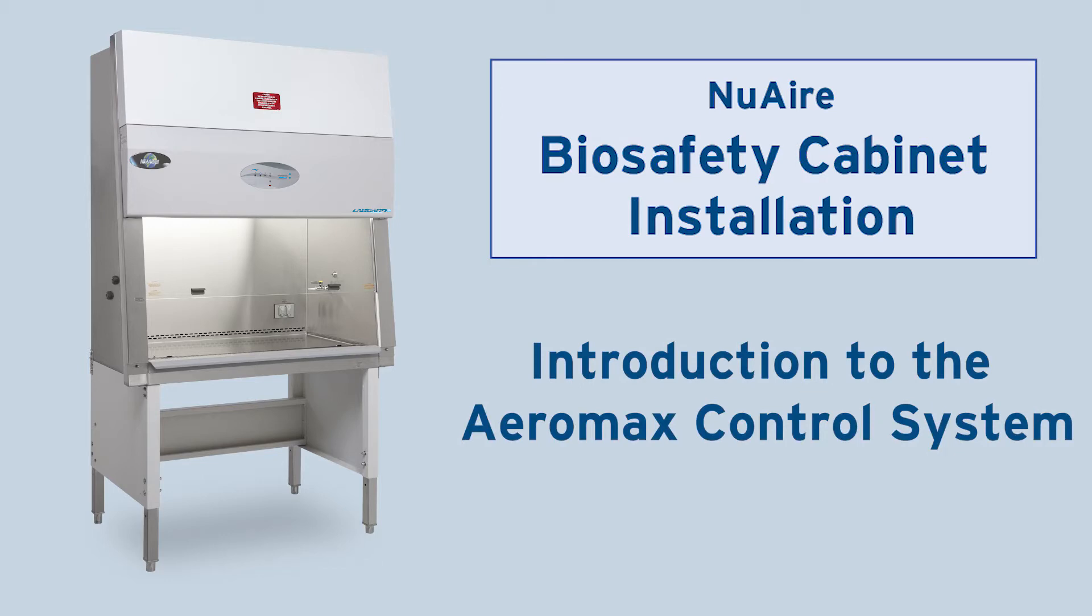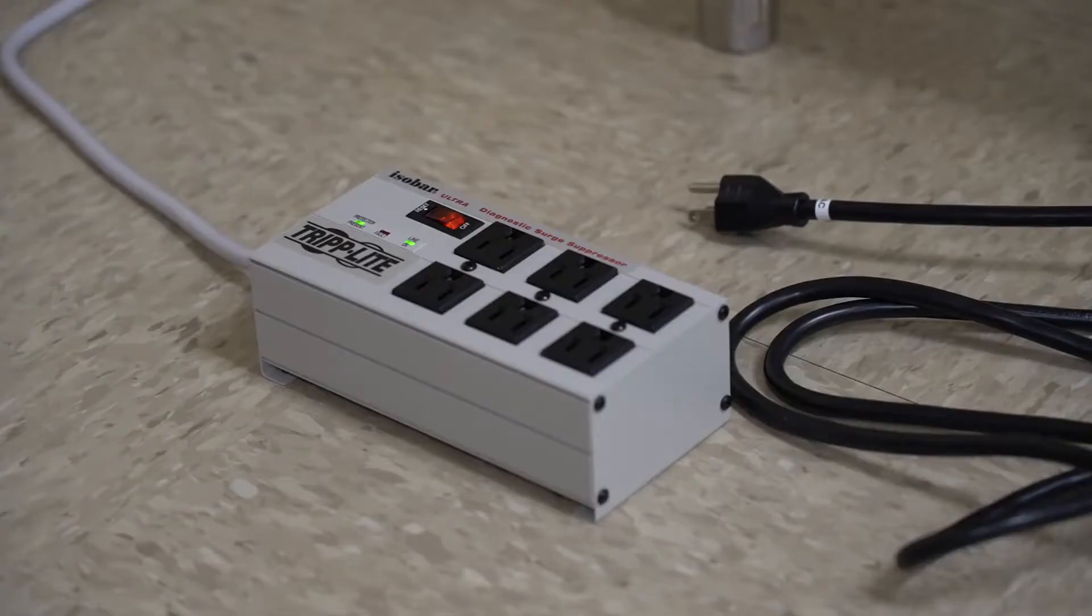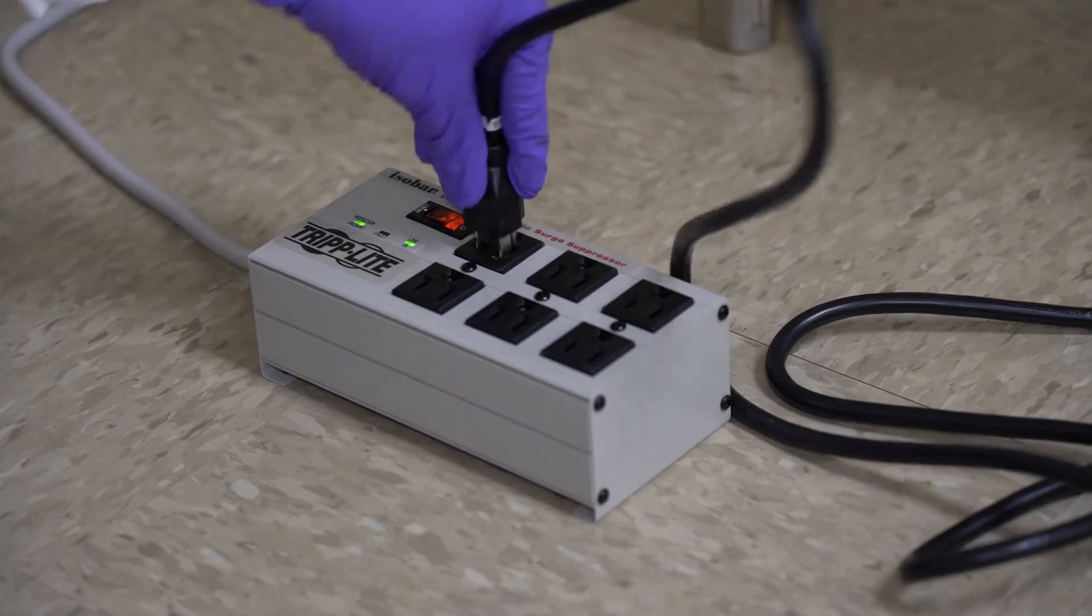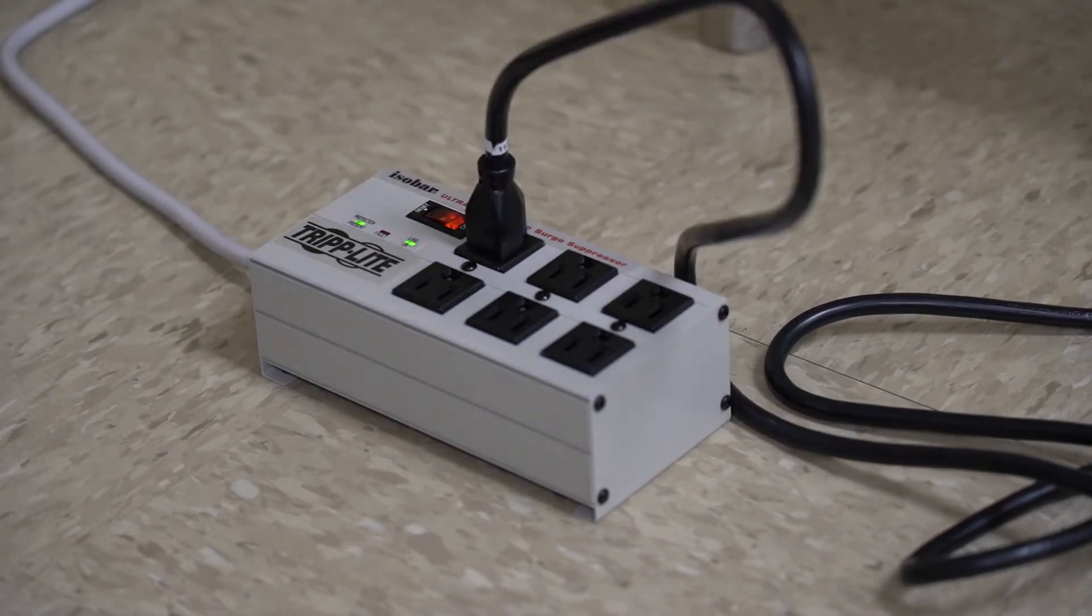This video introduces you to the Aeromax control system. Connect the biosafety cabinet to a surge protector. Connect the surge protector to a dedicated outlet that meets the criteria on the front data plate.